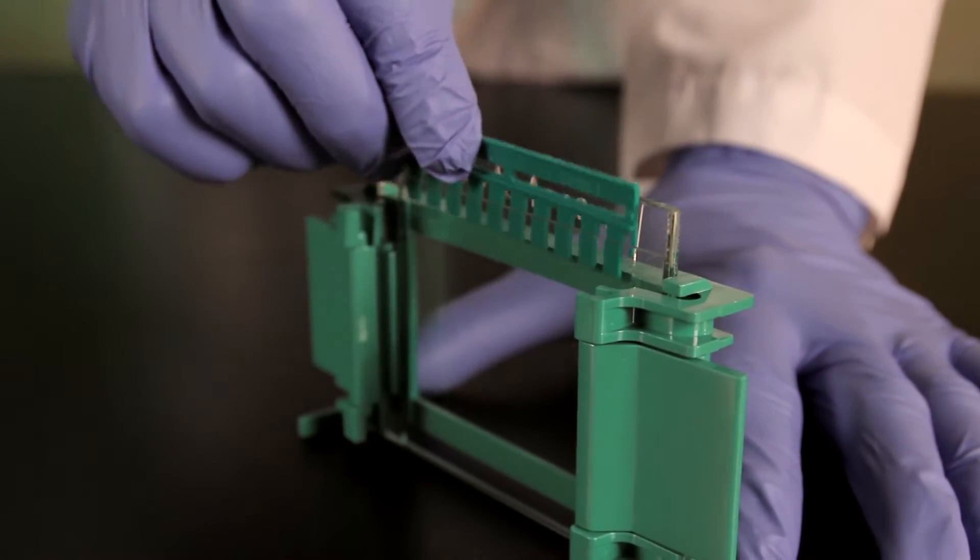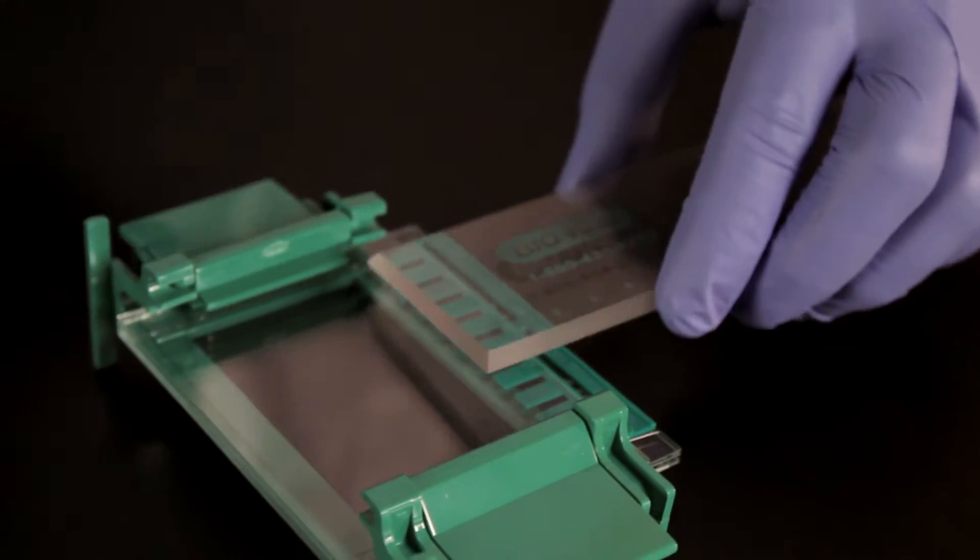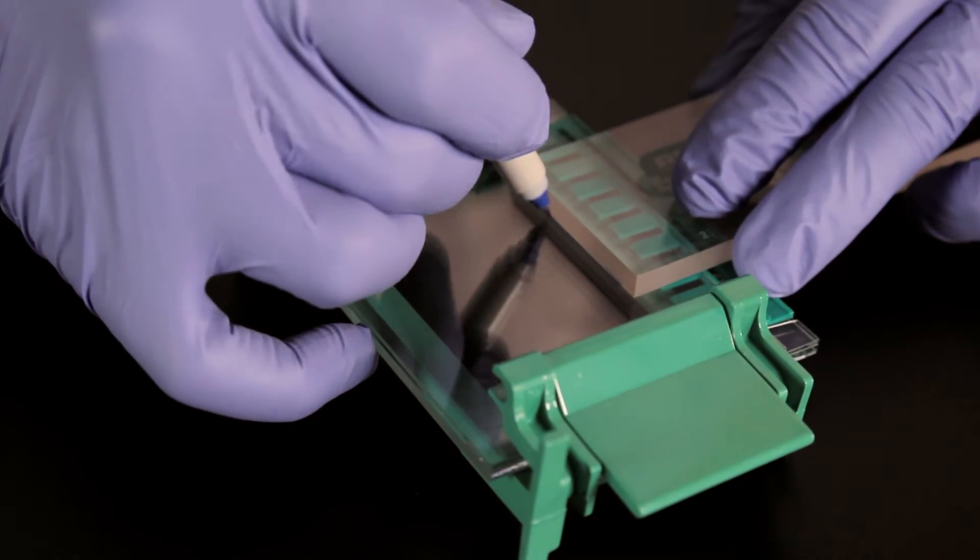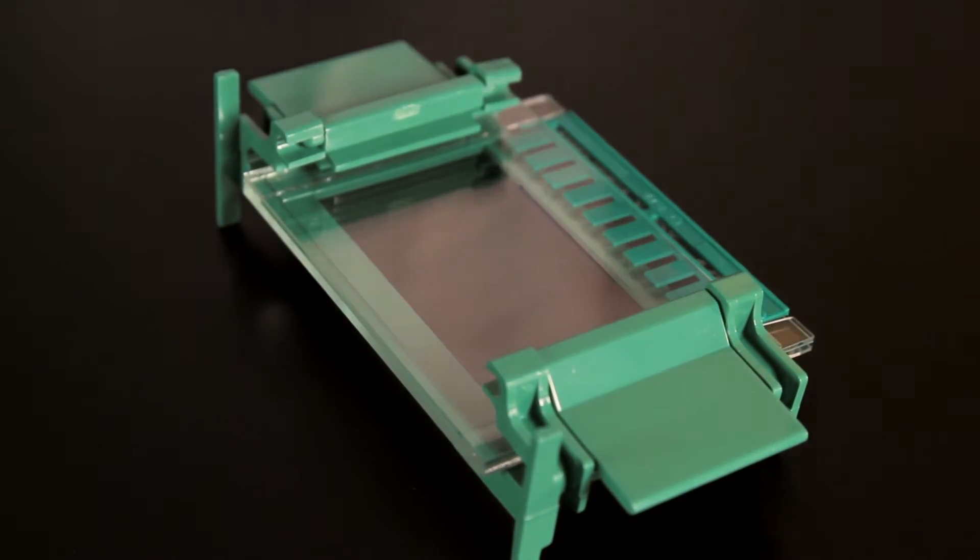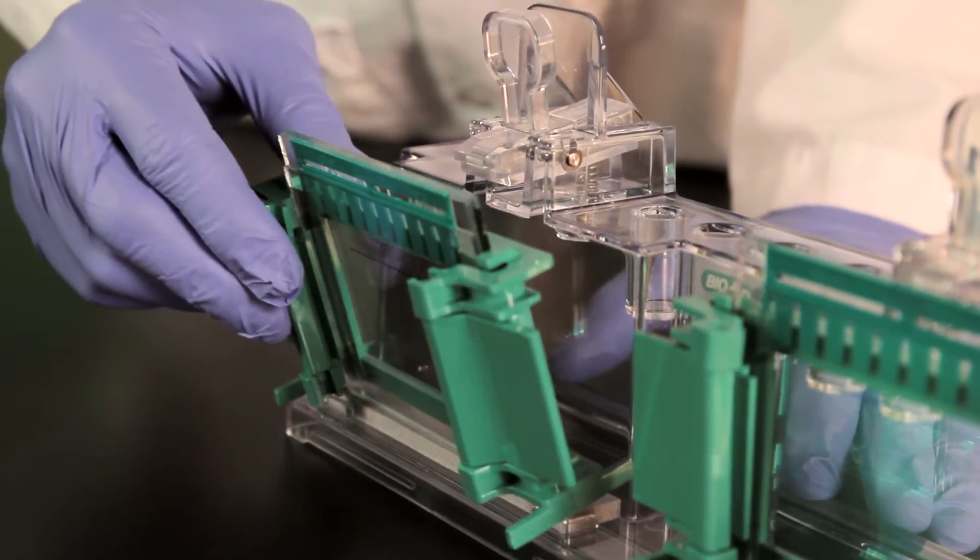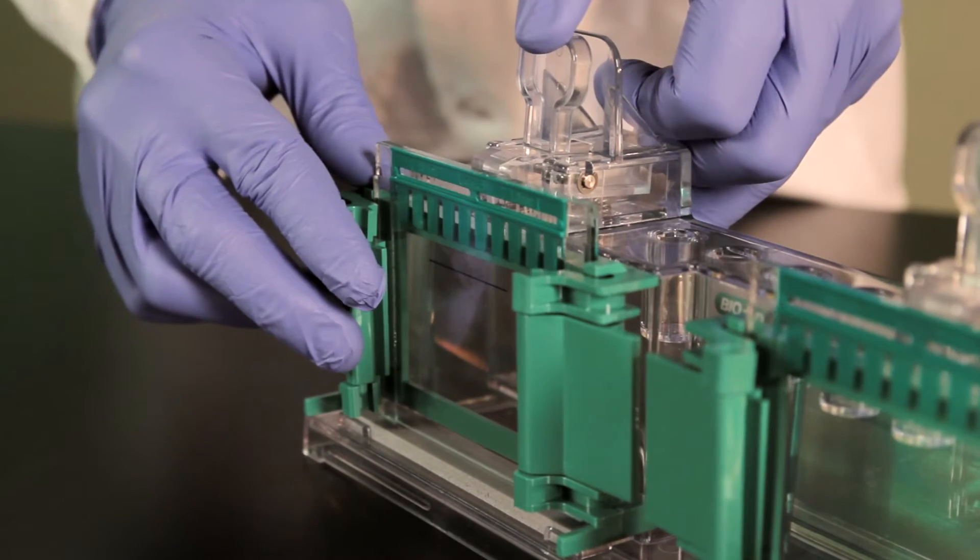Place the comb completely into the assembled gel cassette and mark the glass plate five millimeters below the teeth of the comb to indicate the level to which you will pour the resolving gel. Make sure the gel casting stand and gaskets are clean and dry and place the casting frame into the casting stand.